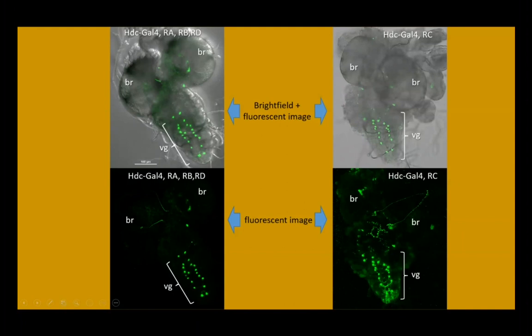The living tissue between these 2 larval brains appears to be similar. The closeness of these images may be due to it being difficult to detect all cells in the live tissues. We really can only see a few brain neurons in the hemispheres, and 10 cells in the ventral ganglion for both specimens.